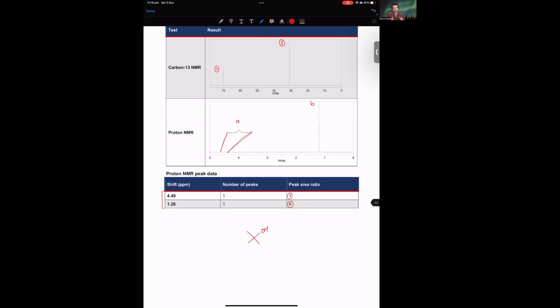It's kind of hard to draw, but if you think about this 3-dimensionally, if you orient your OH straight up, these 3 CH3s are going to be equally dispersed pointing downwards. So if you imagine a pole going through the OH and through the center of the molecule, each of those CH3s are equivalent to one another in terms of their proton environment and the amount of de-shielding that they feel. So therefore, that's why we have the 1 peak, and it's a singlet.